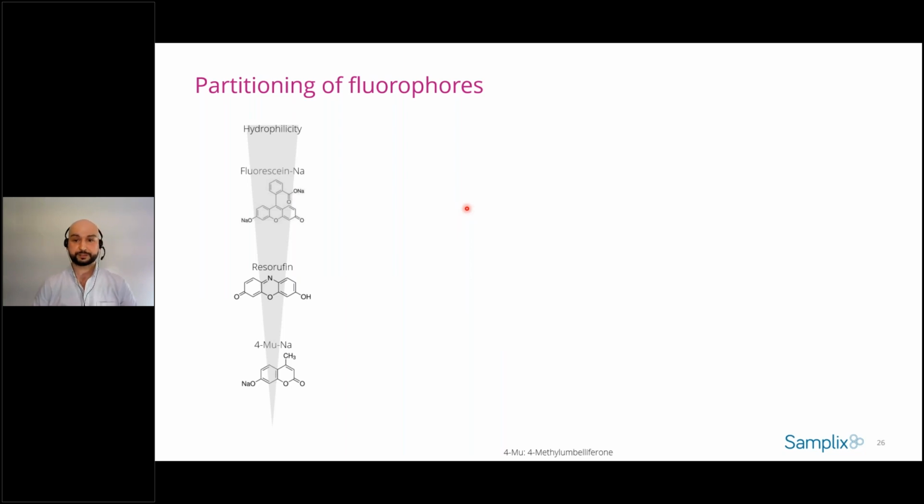Afterwards, and this is important in terms of the assay that we will perform, that I will show you, we chose different fluorescent molecules that mimic the substrate that will be used later in the enzymatic assay.